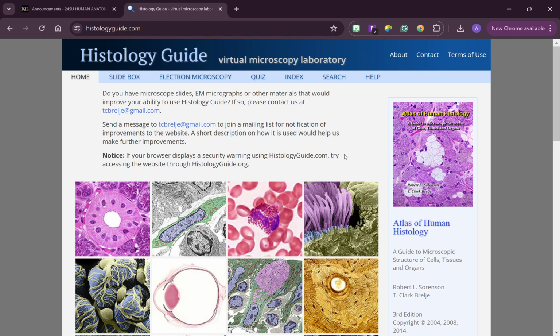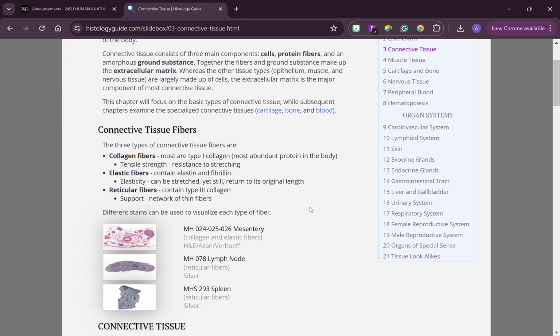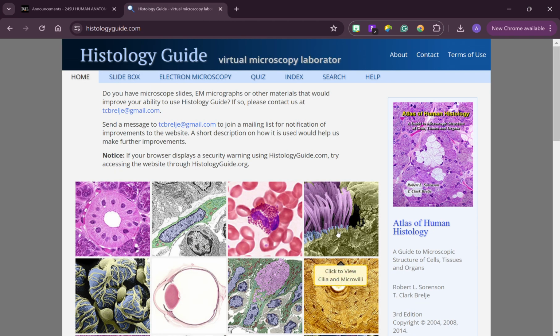The microscope, whether it's in person or whether it's online, it takes time to get used to mastering the tool. And there's no disadvantage to using an online microscope compared to an in-person. You can learn the same traits, qualities, skills. So please explore this website. Learn how it works. Fiddle around with it. Play with it, right? Yes, and please don't forget that this is an excellent resource for our class.